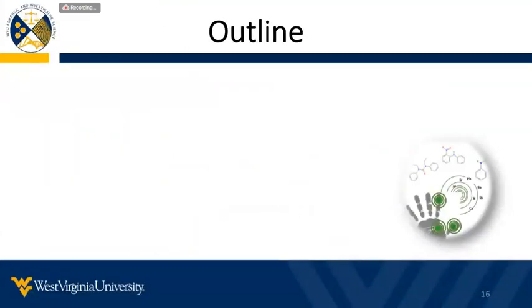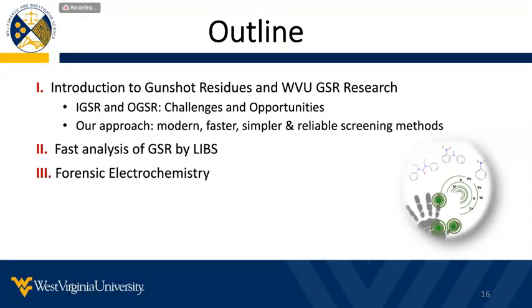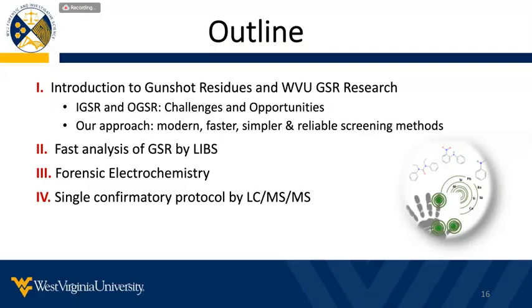All right, so now the reason why we are here today, the webinar will be divided in 5 parts. First, we will be presenting a brief introduction to gunshot residues, and we're going to be describing our approach here at West Virginia University for detection of GSR. Then we're going to be describing the results for different applications, including LIBS, electrochemistry, and LC-MS, and finally, some summary conclusions and future work.